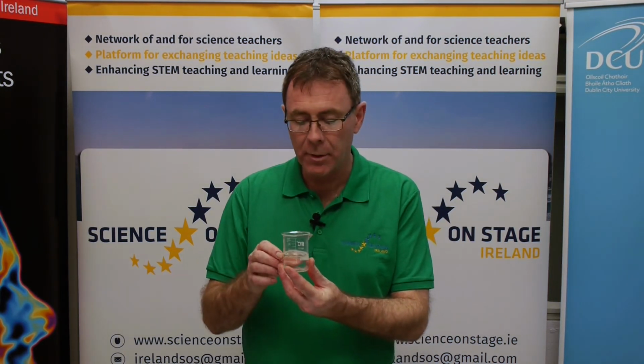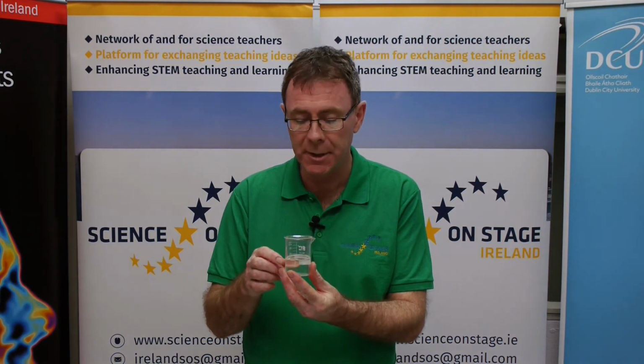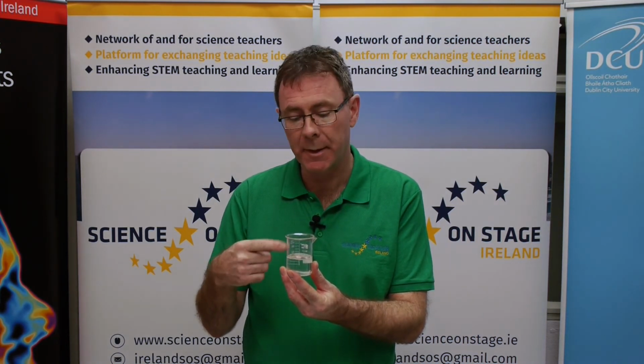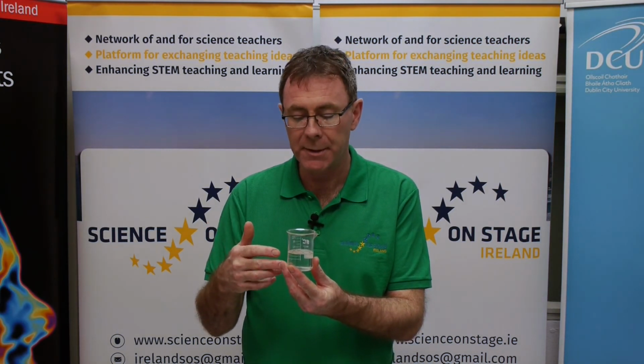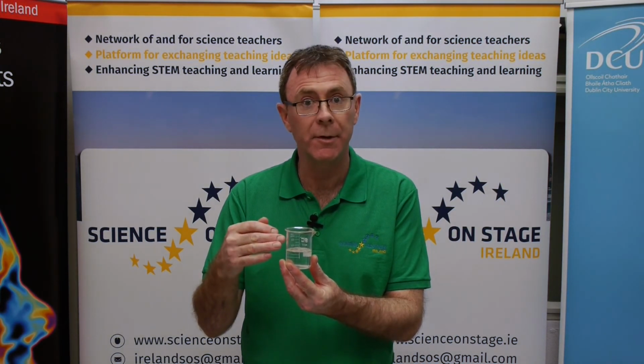But the discs that are placed in the light for 1 or 2 hours, actually, it only takes about 10 or 20 minutes usually, they'll rise during that time period. Now, you can use this experiment to measure the rate of photosynthesis by timing how long it takes for the average leaf disc to float.